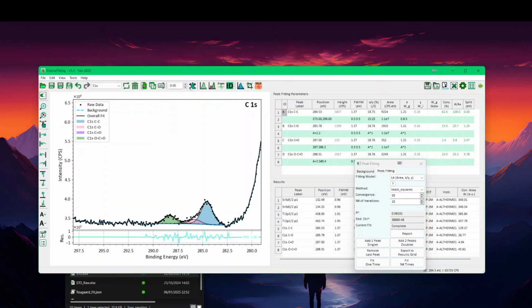And because there is a CC, you can just use the automatic binding energy correction, and it will look anywhere in your file where there is this carbon 1s CC. That's done here, and now everything has been corrected, knowing that CC should be at 284.8. Okay, you can put it back because this was 0.27. It's been found to be 0.27. You can put it back, click on the plot because it doesn't correct it. Click on the plot, and you can now see that it's all back to normal.